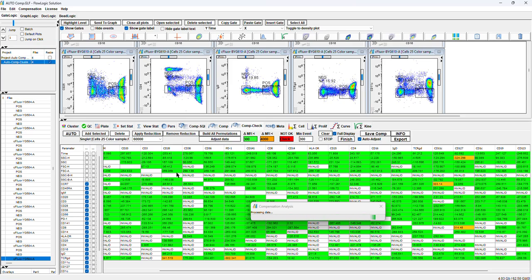The process is nearly finished, and at this point, depending on the computer that you have, it's reasonable for these types of files to take 10 to 15 minutes top to get the full compensation checked and adjusted. We have another cell fixed. So now, okay, something came back during the update.